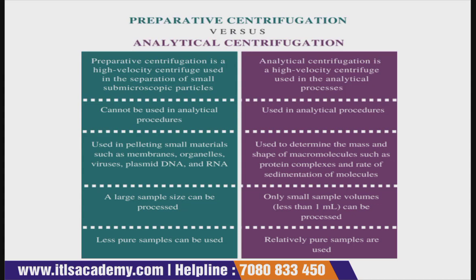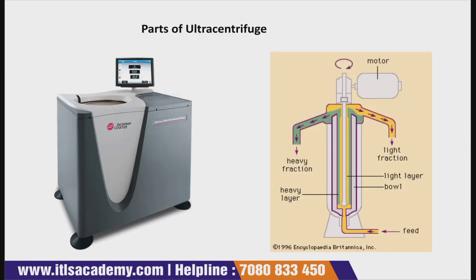A larger sample size can be processed here, but in analytical only a small volume can be processed. So these are basic differences that you should always keep in mind whenever you are giving any interviews or any exams. So these are the part of ultracentrifuge.